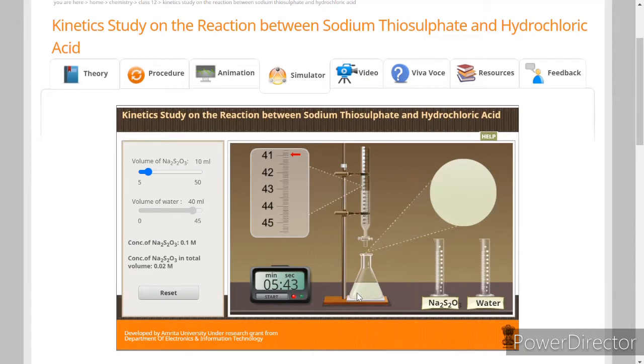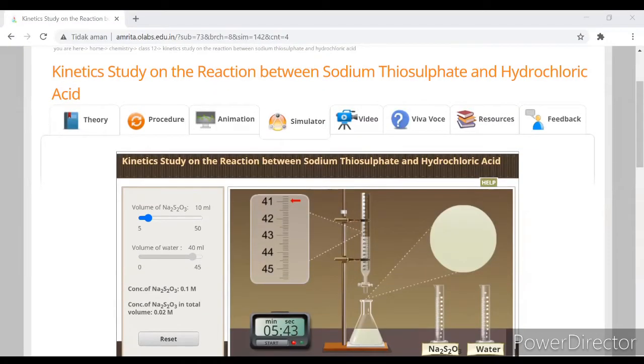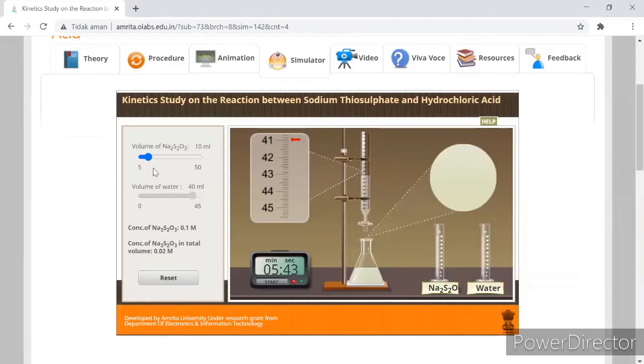Unfortunately, the flask available in here is just one. So after that, we should reset it to do the second experiment. We should write the amount of time that we got in flask A on Microsoft Excel. Yeah, 5:43. Conical flask B, we will reset it first.